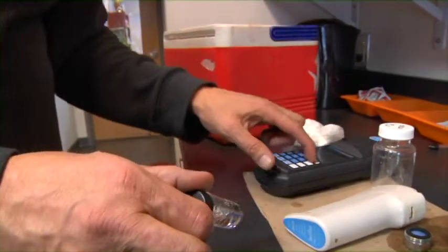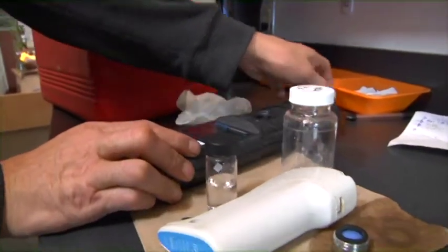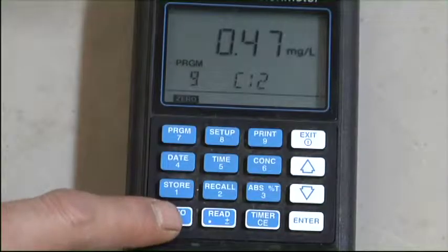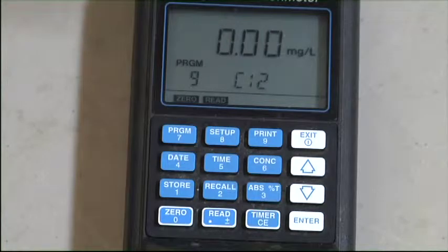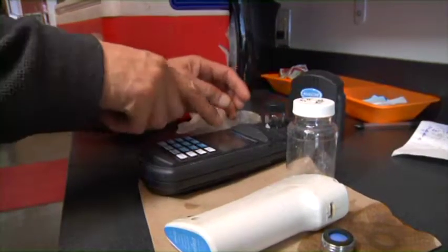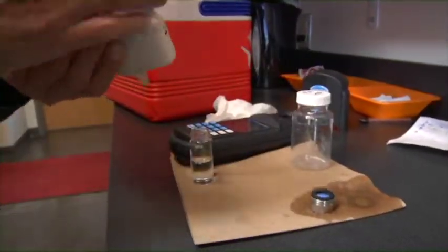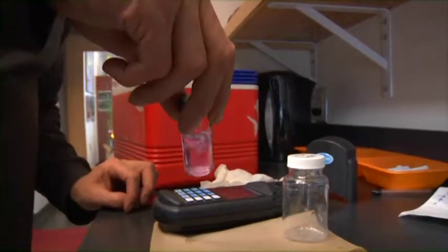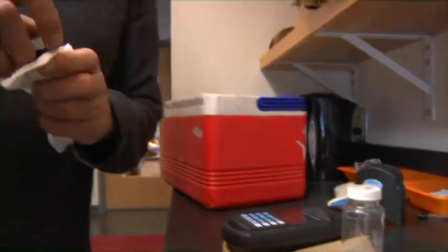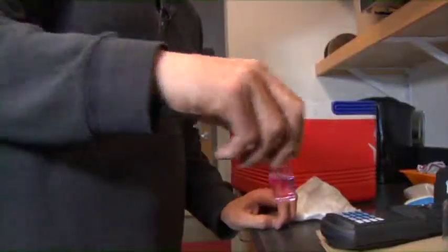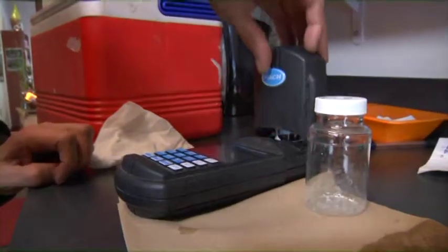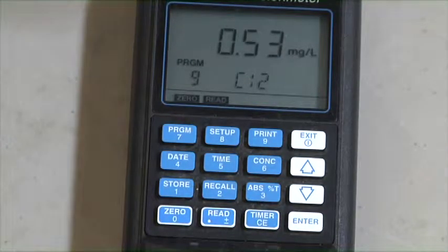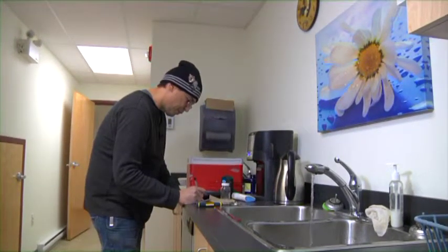Wipe the outside of the bottle with a lint-free cloth so that it is free of fingerprints and dust. Then place the blank in the holder with the diamond mark facing you and tightly cover with the instrument cap. Press the zero button and the display will show 0.00. Next, remove the blank from the holder and add one reagent to it. Place the cap back on the bottle and shake gently for 20 seconds. Again, wipe the bottle clean of fingerprints and dust. Then, within one minute after adding the reagent to the sample, place the blank into the holder with the diamond mark facing you and tightly cover with the instrument cap. Now press the read button. The instrument will show the results in mg per litre of free available chlorine. Be sure to record the results on the sampling record sheet.